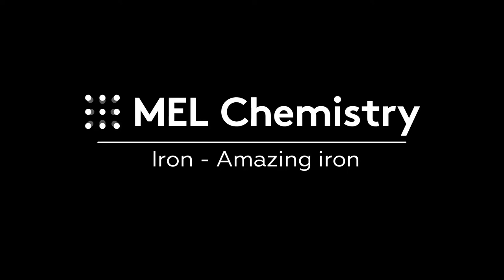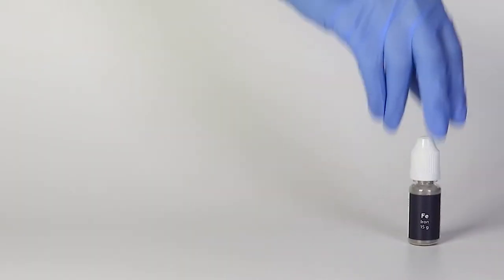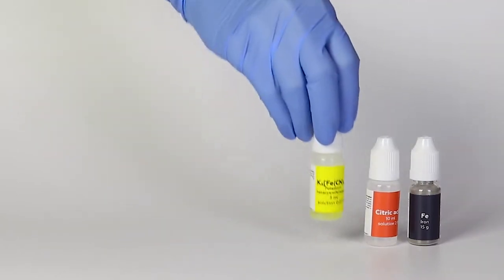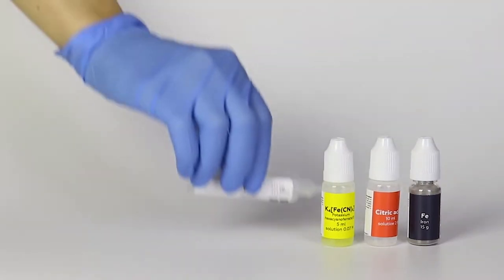For the amazing iron experiment, you will need iron powder, solutions of citric acid, potassium ferrocyanide, and hydrogen peroxide.